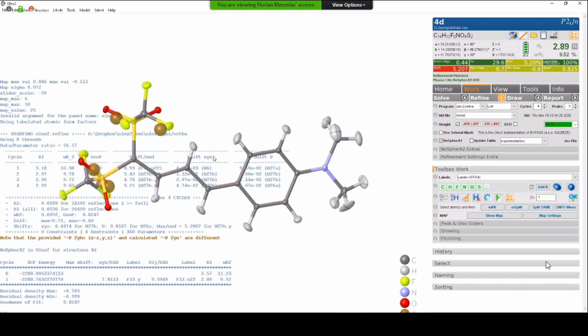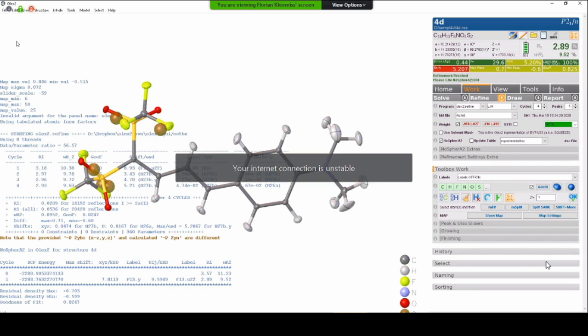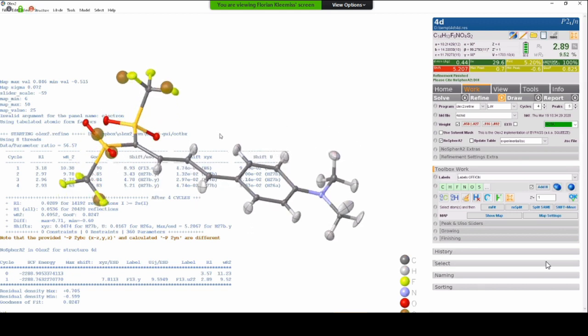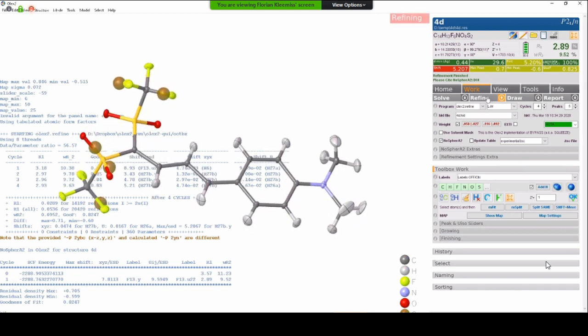But the major benefit of Hirshfeld atom refinement is that we can also describe the hydrogen in a more sophisticated and more correct way. This means that we can describe the contribution to the bonding of this hydrogen atom more accurately than having the spherical scattering factor, and therefore obtain reasonable bond distances. You can see here that the bond distance for this carbon-hydrogen bond is far closer to what we would expect and what we know from neutron diffraction. And in this way, we can improve our refinement.